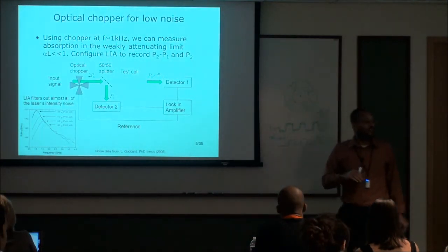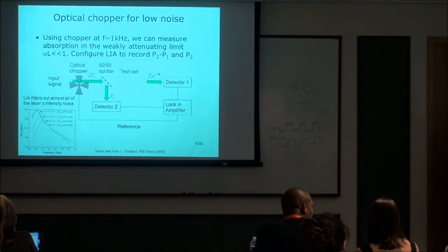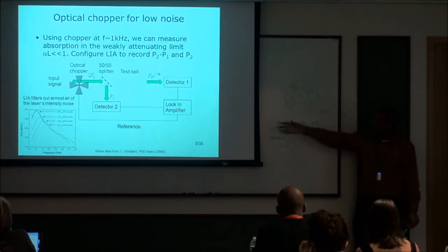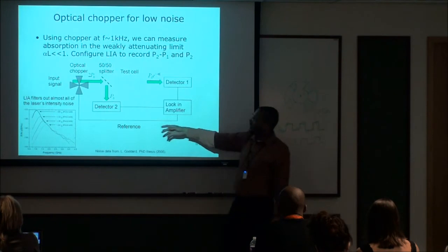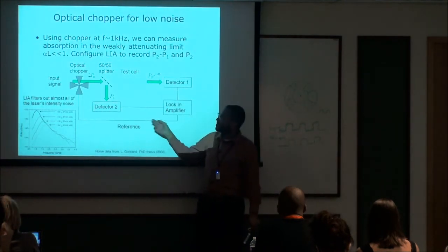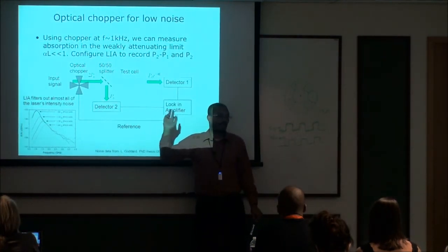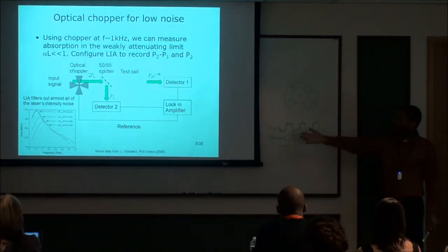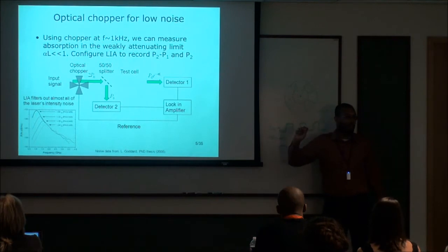Why doesn't it matter that the reference is out of phase with the signal? Okay, so they can be out of phase because in your digital signal processing, let's say the length of this cable is hundreds of times longer than the length of this cable. So when the signals arrive, they're shifted in terms of their time. So you can't necessarily control them to be exactly in phase.